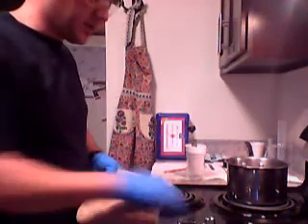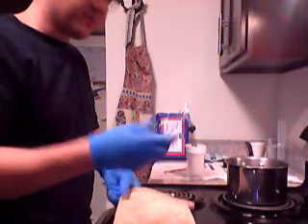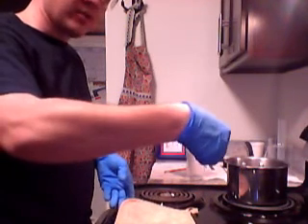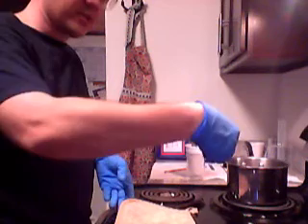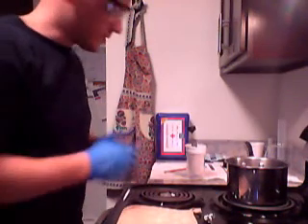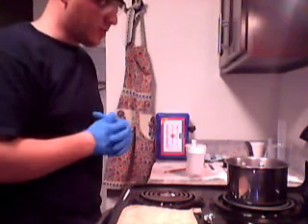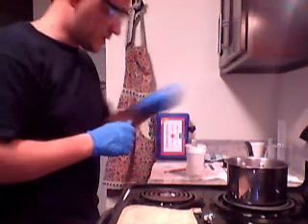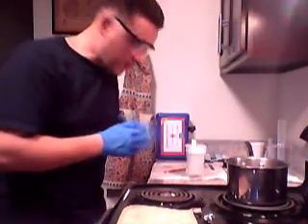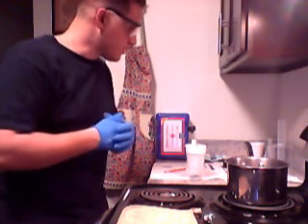And then what I did adjust is when I was using these tongs, or I'm sorry, the test tube holder, I actually used it to hold one end of the metal, so I put it further to the end of the metal so it's easier to put in the cup. I was a little concerned that I was going to melt the styrofoam, but that definitely is not an issue. And then when you're boiling your water, it does take a little time to adjust it down to simmer. I've got mine set at about 4. That seems to be a good place for it for simmering.